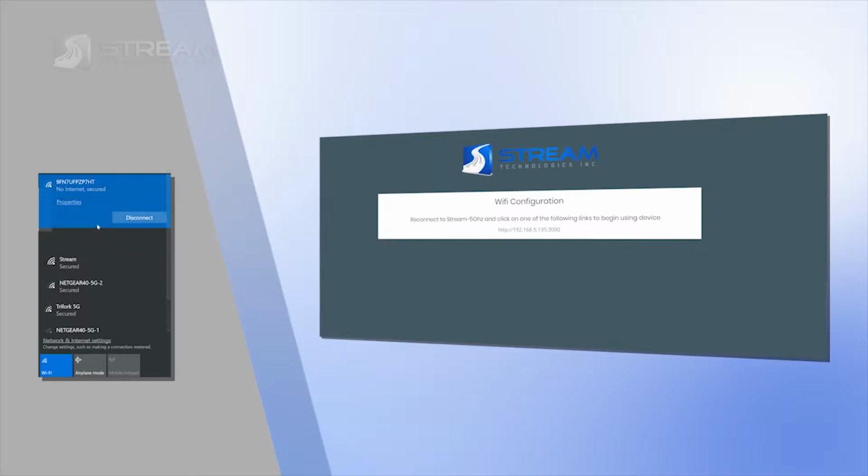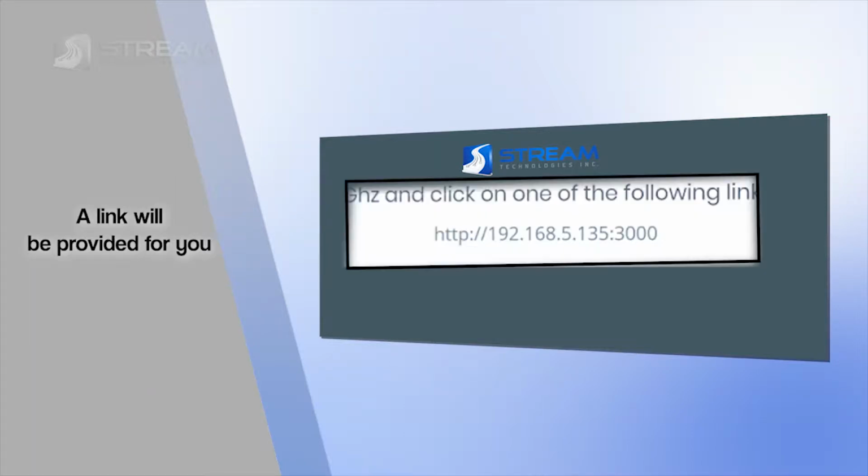So now you'll want to connect your box to your regular Wi-Fi network, and we get to this page here that says to reconnect to that Wi-Fi network with our laptop computer here, and then we can click on this link down here to connect to the device. And then I can click on this link here to connect to the lab box again on the main Wi-Fi network. So that's a one-time setup step there.